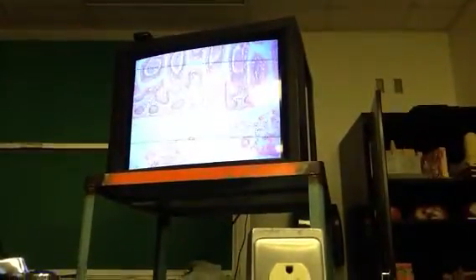So are you going to show a picture of this possibly and ask the layers? No, we'll use slides, microscope. Not going to use pictures. Well, that's what I meant, the slide. Are you going to show a slide like that and ask the layers there and what it is? You can ask anything. Yeah, ask whatever's there.